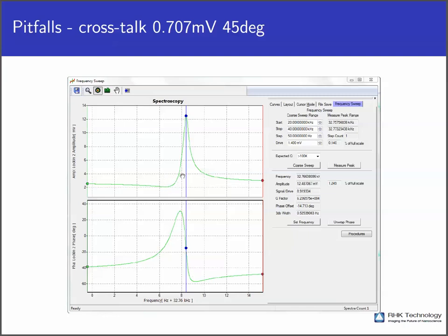and the amplitude resonance is kind of unbalanced, and you see that the signal here actually drops before it goes into the resonance. There's a minimum right here in front of the resonance peak. That is something very suspicious. This is usually where the detected signal of the two paths cancels each other out, or partly cancels each other out. You see these drops here. That's always a sure sign of crosstalk. Now this is a very dangerous situation for the PLL because our phase range is greatly reduced.